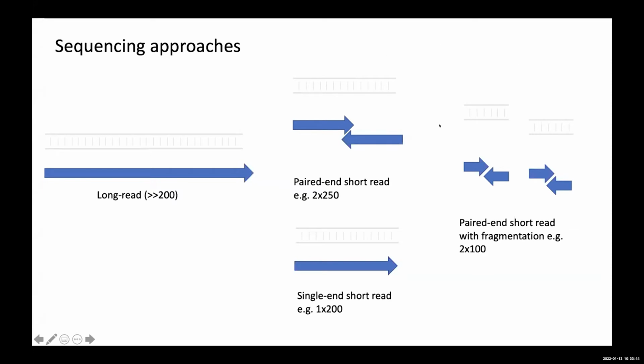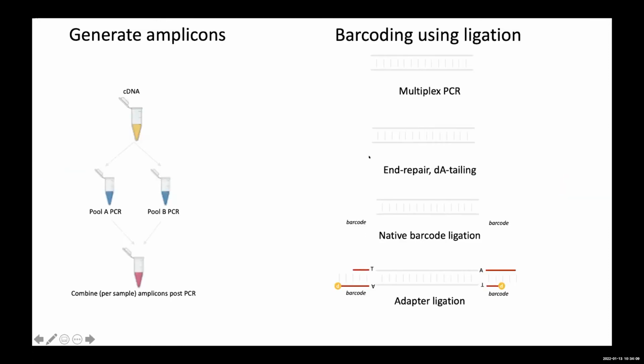We don't do that for the nanopore prep. We target with the ARTIC protocol 400 base pair amplicons, which is compatible both with nanopore and Illumina. So it's on the short end of the nanopore ideal range, and it's on the long end of the Illumina ideal range. But it means that you can sequence those amplicons on both platforms without doing any additional fragmentation steps, which we like. And it gives you good quality sequencing data without the requirement to do too much downstream bioinformatics.